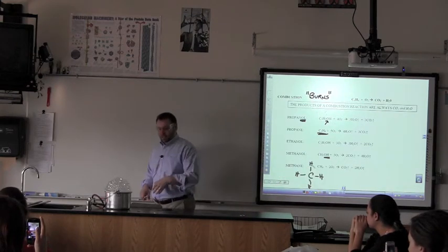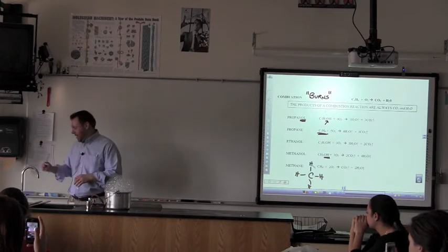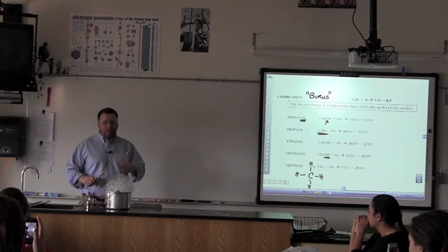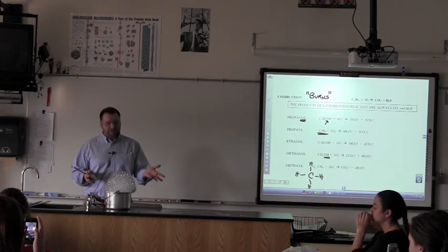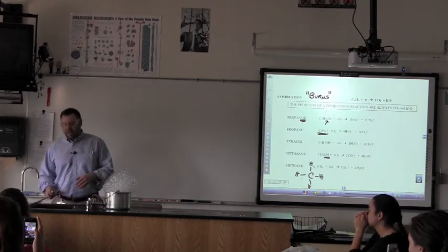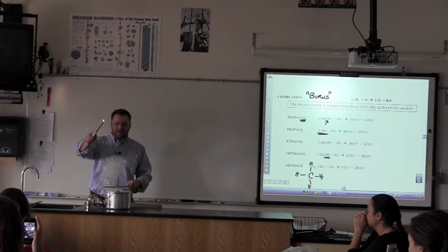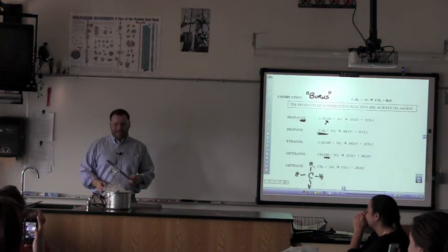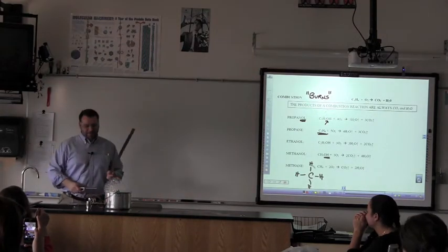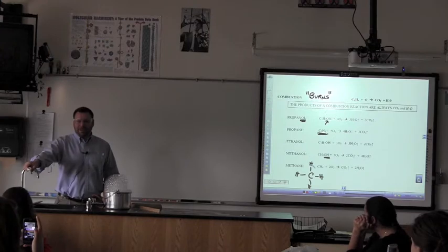So all this is dish soap. And I'm not too concerned that you're going to try this at home because, hey, you don't have methane at home. So what you have here, though, is the methane being captured by the bubbles. Pretty simple. They're also lighter than air, so then they'll float. So you can do things like this with it. Nice. We'll get it a little bit bigger. We'll wait till it looks like Marge Simpson this time.